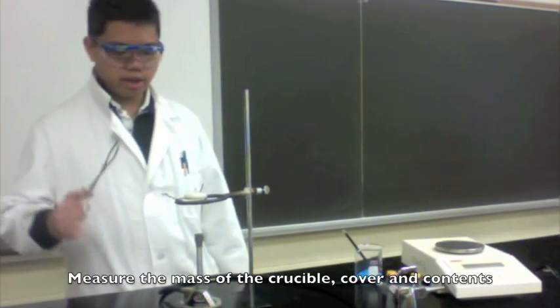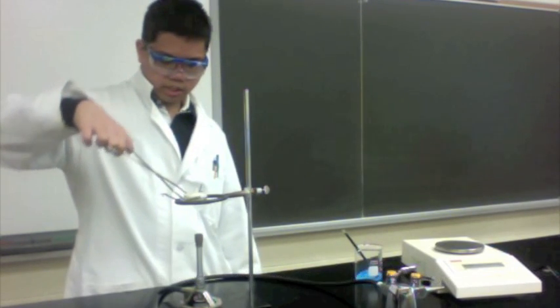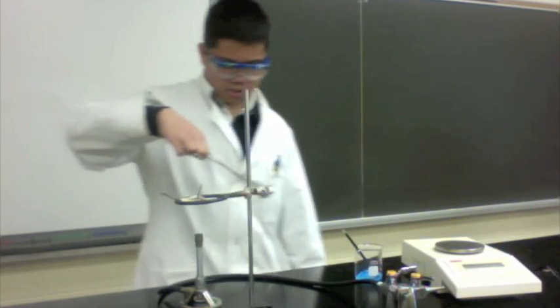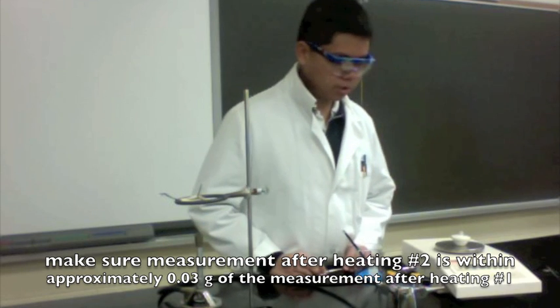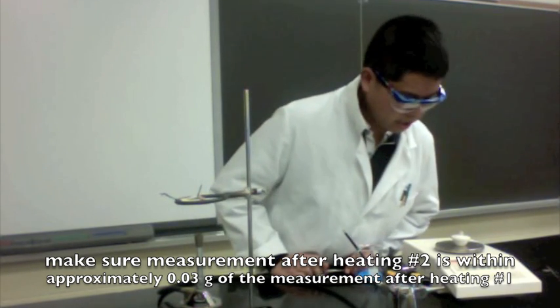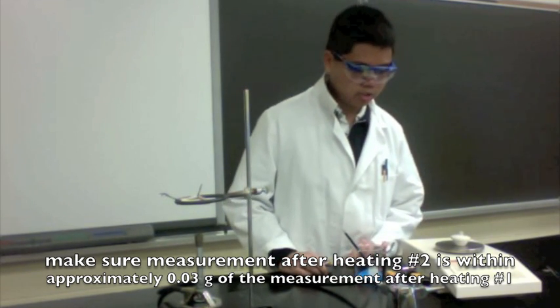Once again you'll have to take the mass of the lid, the crucible, and the contents. Take the crucible with your tongs and carefully place it on the scale. This mass should be within three hundredths of a gram of the last measurement. If it isn't, you should talk to your instructor about your mass determination process or your heating process.